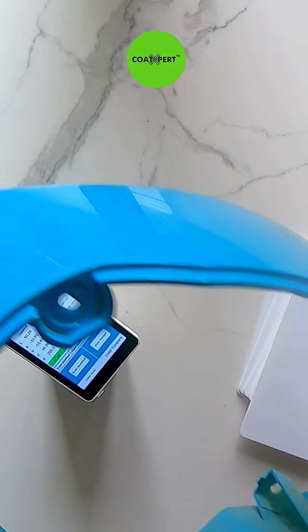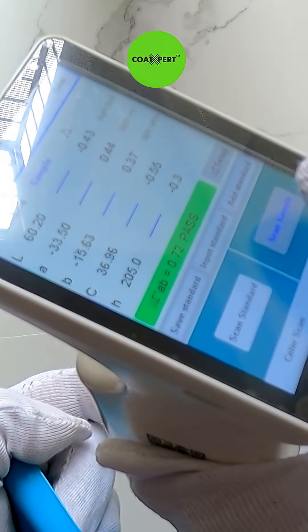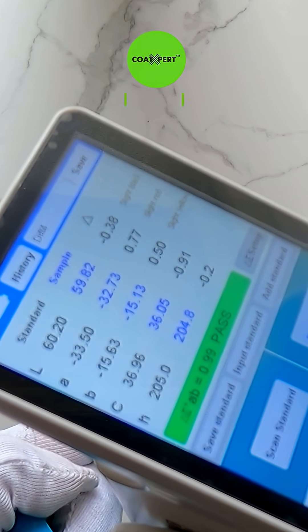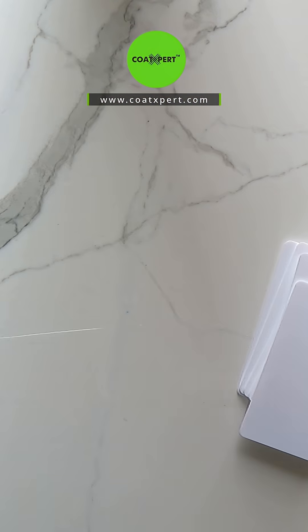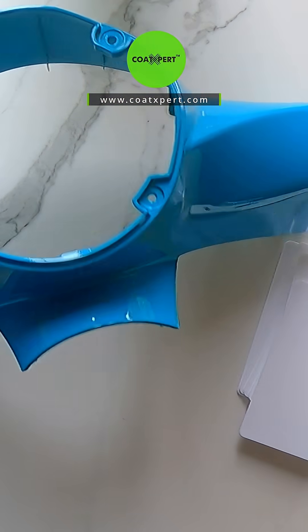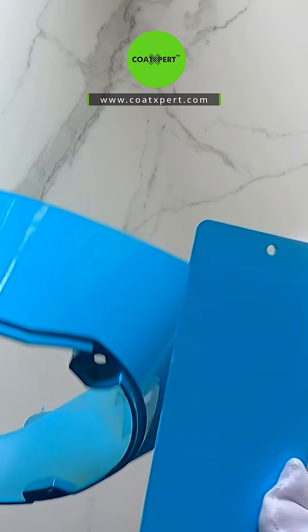The color value shown on the panel — I'm checking whether it is matching with the part or not. It is matching; it is below Delta value 1, so it is showing that it has passed.